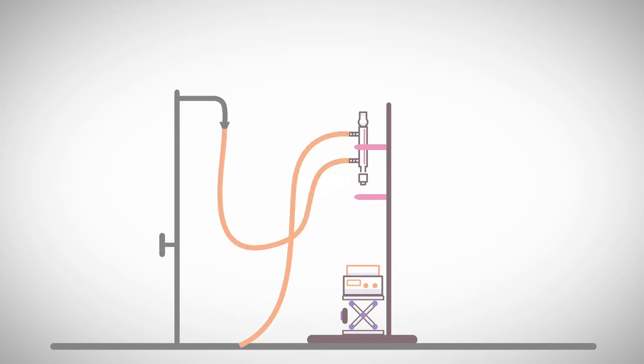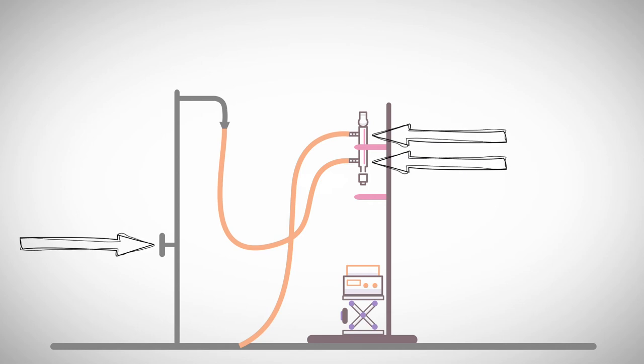Connect the yellow hoses to the condenser, in hose to the bottom and out hose to the top, and turn on the water.